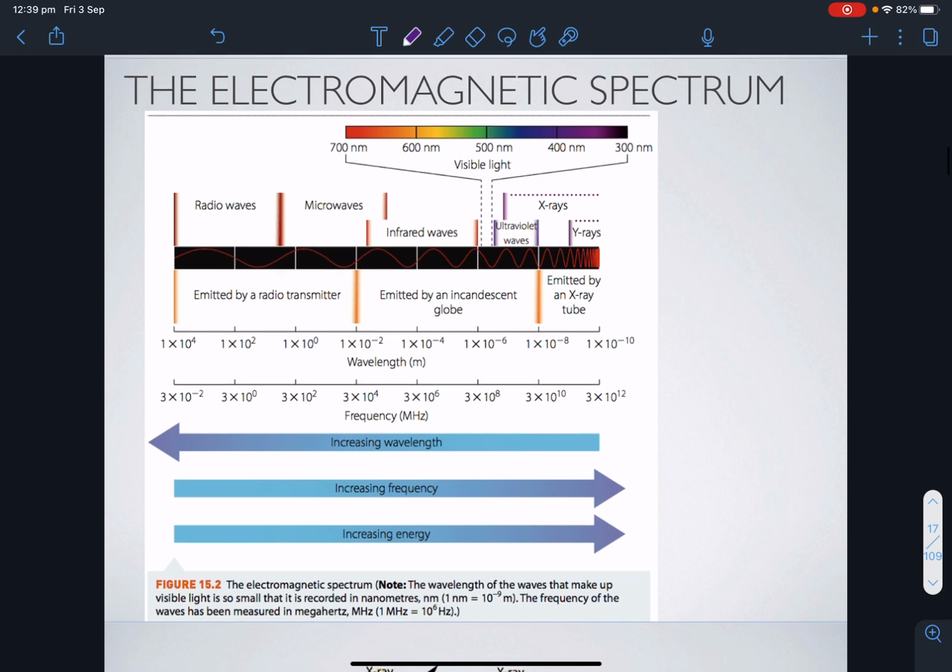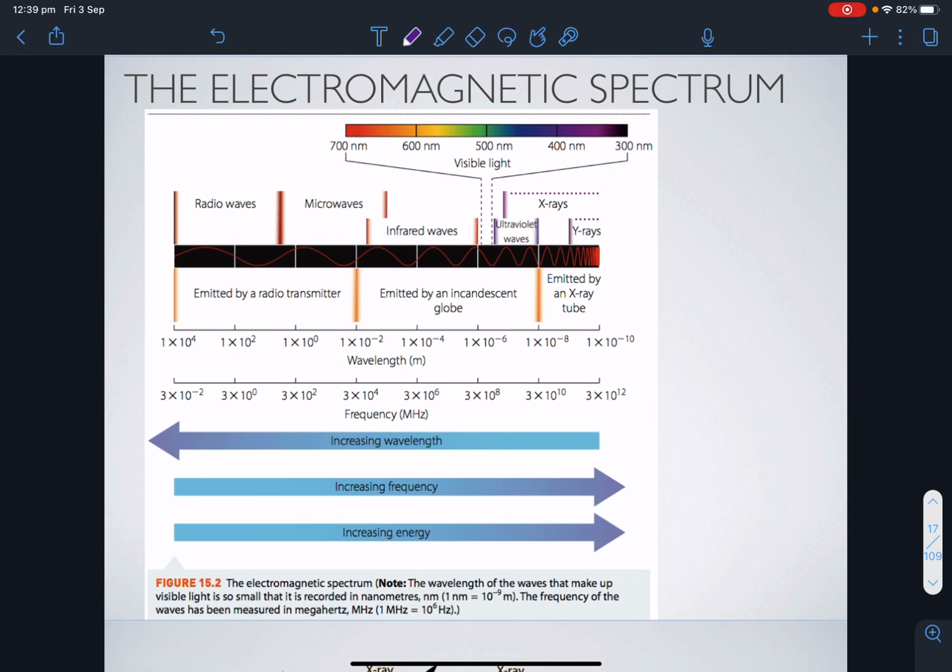So just a reminder about the electromagnetic spectrum, which is the range of energies and wavelengths of electromagnetic waves, okay? It'd be important to be familiar with the relative energies and frequencies. So we've got UV light. We talked about UV light a bit in UV vis spectroscopy in the last chapter. And beyond there we've got infrared in this direction, so longer wavelengths, lower energy, infrared, and we're going to talk about that in infrared spectroscopy.